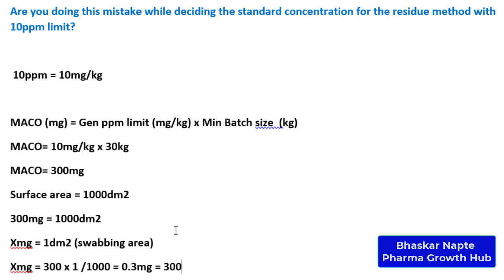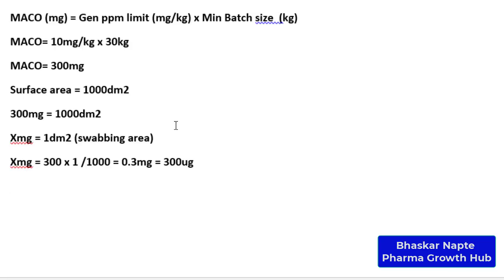So 300 microgram of residue is present in 1 dm² of area. Or I can say each swab will consist of 300 microgram of residue, because 1 dm² is the swabbed area and that content gets carried onto the swab. Ideally speaking — not accounting for recovery — 300 microgram will be carried forward onto the swab, so each swabbed sample will contain 300 microgram of residue.